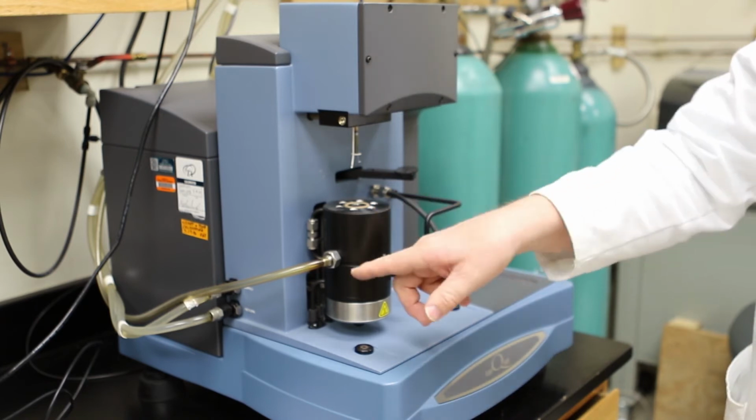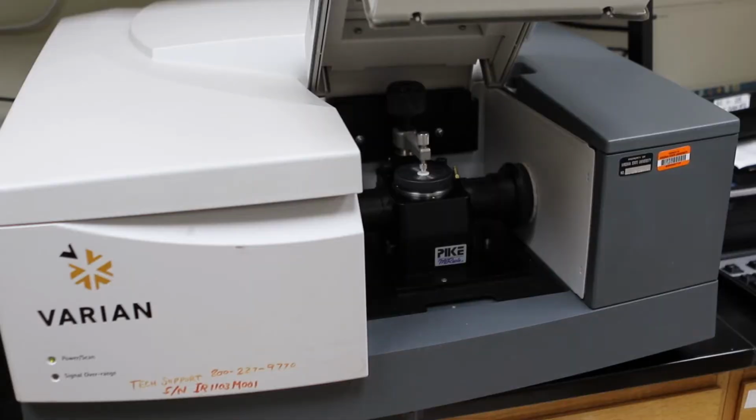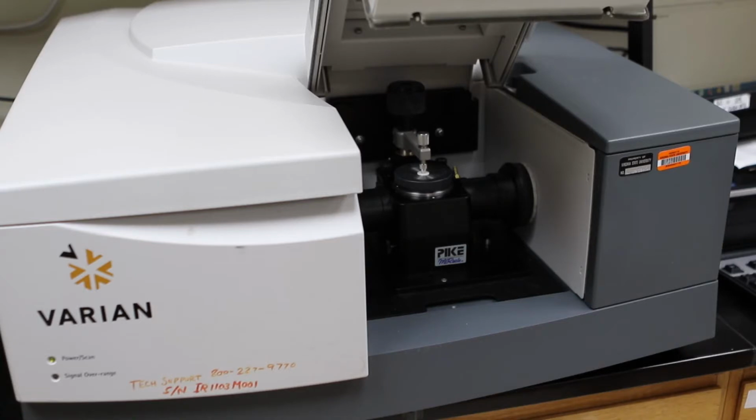That measures thermal changes in a material as it decomposes with heat without burning. Different materials have different decomposition properties. So this machine will give us information about composition and how that material breaks down.